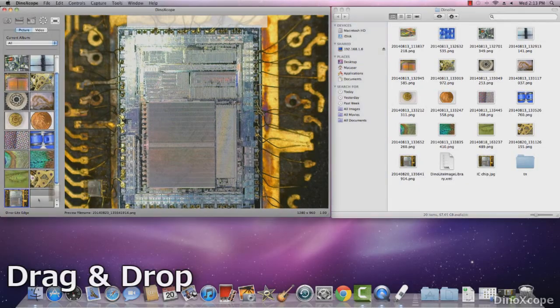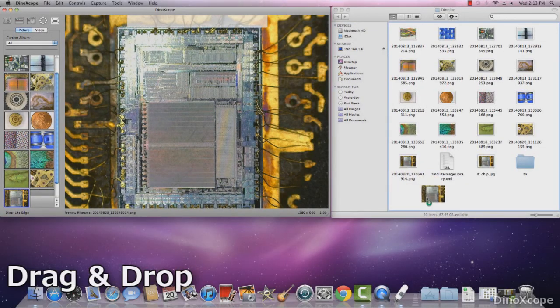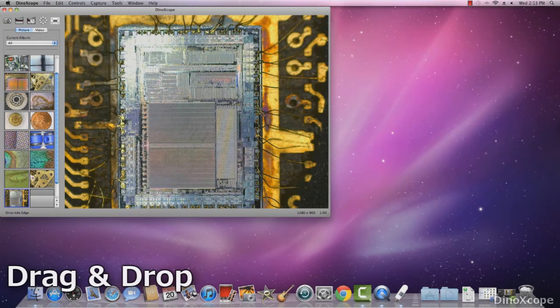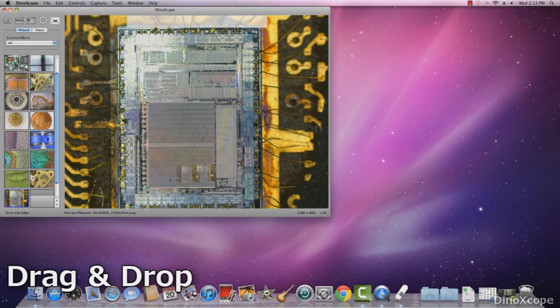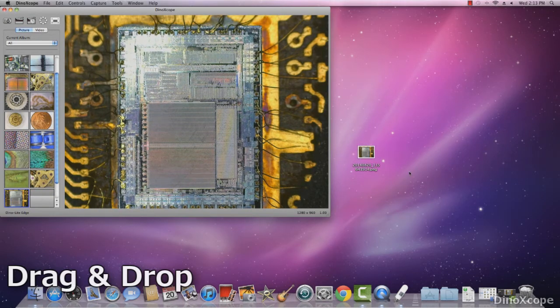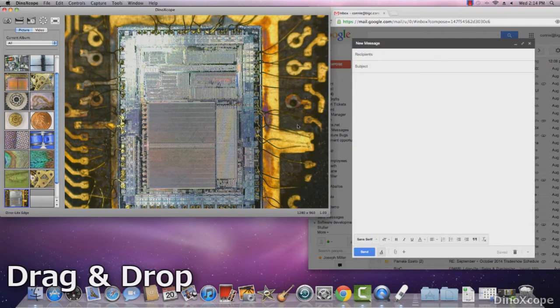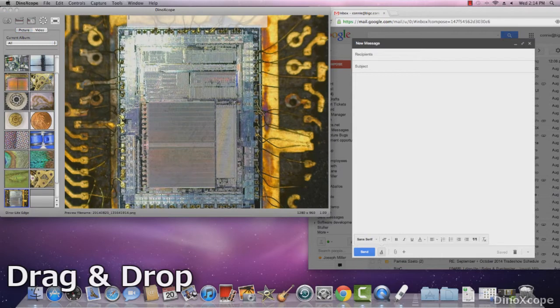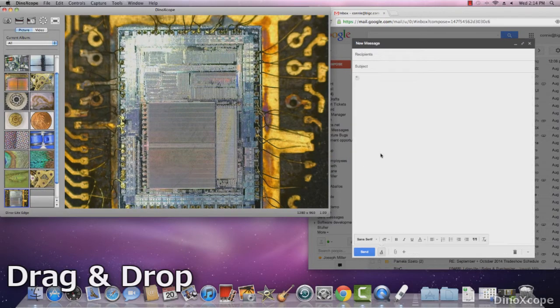Images can be dragged and dropped from the thumbnail gallery to other locations on the computer by simply clicking down on an image and dragging it to the desired location. Whether desktop, folder or even directly to email, then release the mouse click to drop.